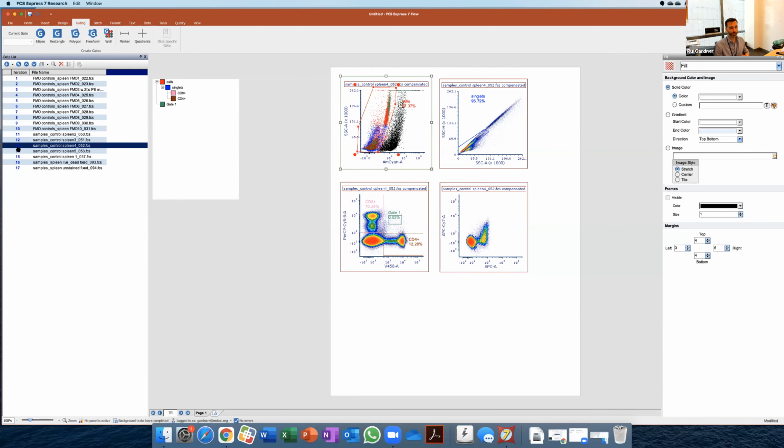You can't expect, from experiment to experiment, that those tandem dyes will be exactly the same and have the same spectral properties. And the same thing with the single stain controls for compensation. You should bring them always fresh, or even better, you should always stain them at the same time as you're staining your sample, if you want to have good quality data, right? I would agree. It's a bit more time consuming and possibly more expensive, but your data is much more robust and believable.